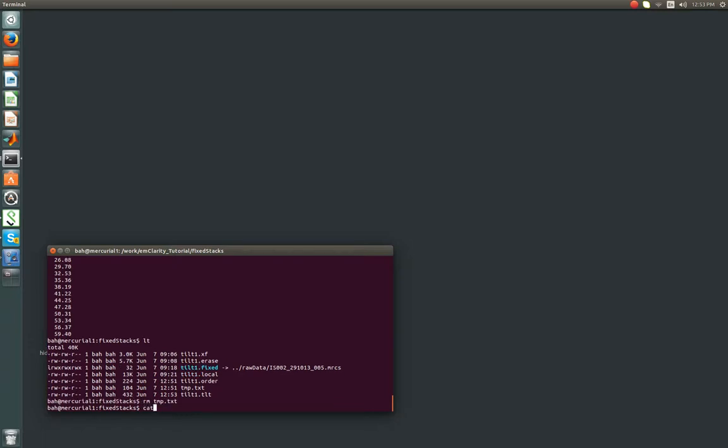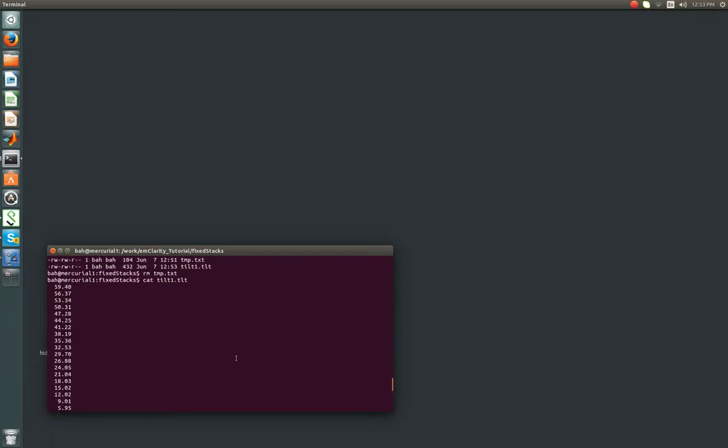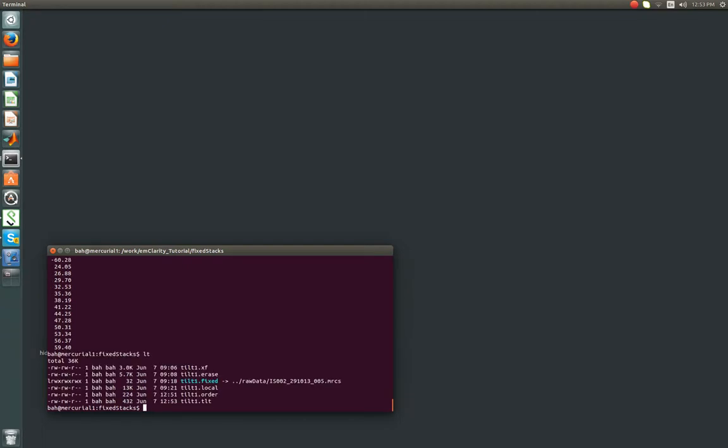So if we print out tilt1.tilt now, we see that we've tacked on these values. So we go from positive 20 to negative 60, we jump the whole way back to positive 24, and work our way up to positive 60. So we now have our tilt1.order, and we can remove temp.txt. It's probably good just to check to make sure, given the sort of things I like to do, that we didn't screw up the angles in temp.tilt, which we don't. Alright, so now we have the order of data collection was important for using exposure filter.